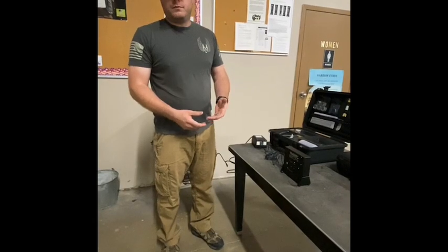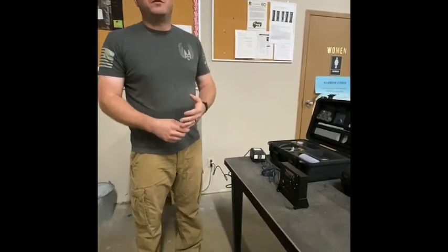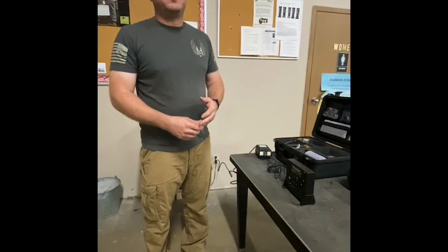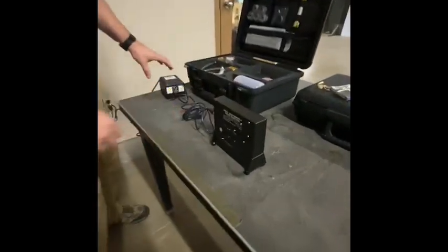in your fuel. If you're dealing with aviation units, you're not going to be able to issue if you have more than 5 parts per million. If you're dealing with ground units, you're not going to be able to issue if you have more than 10 parts per million. Anyway, this is your testing unit and your power supply.